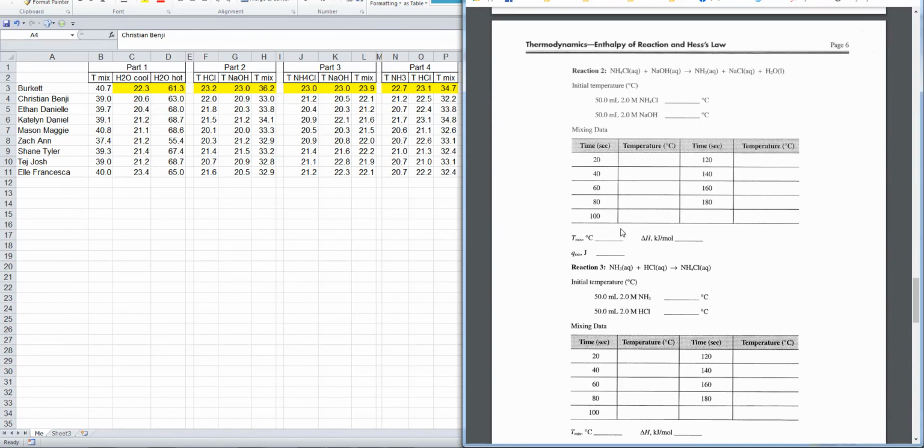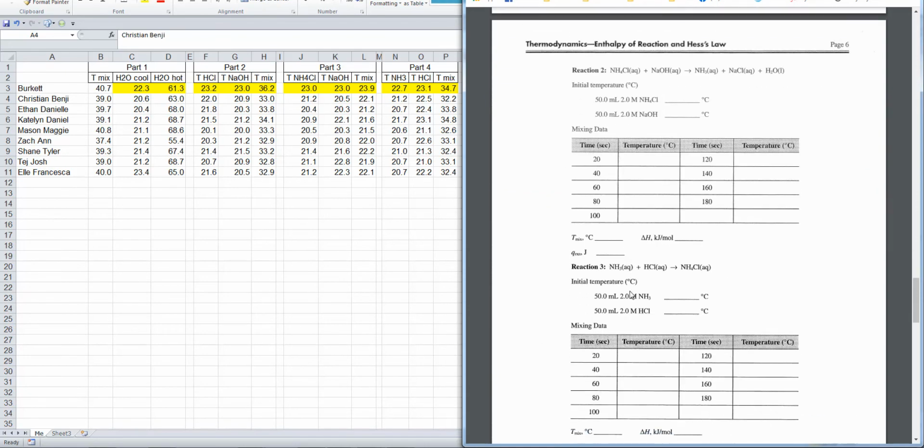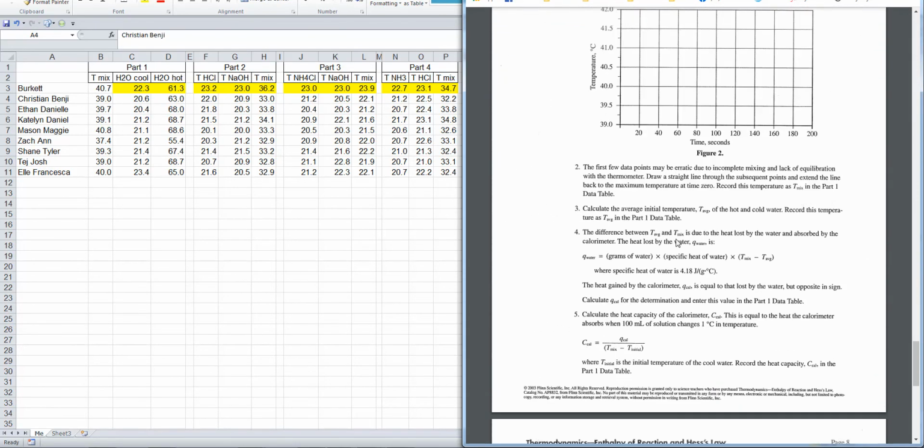So that number would just go up here, T-mix. And then average, you're going to calculate that. That's just the average, I think, of your hot and your cold. And then really just read through the calculations you're supposed to do. So calculate the average initial temperature of the hot and cold water, record this temperature, and so on.